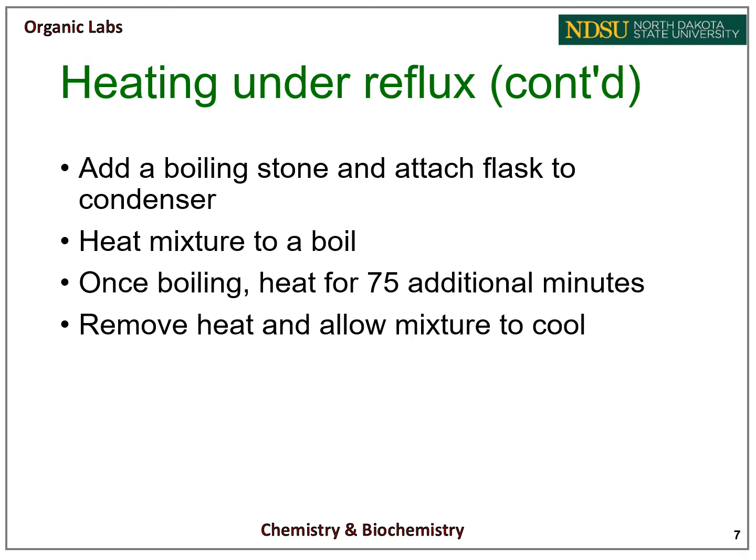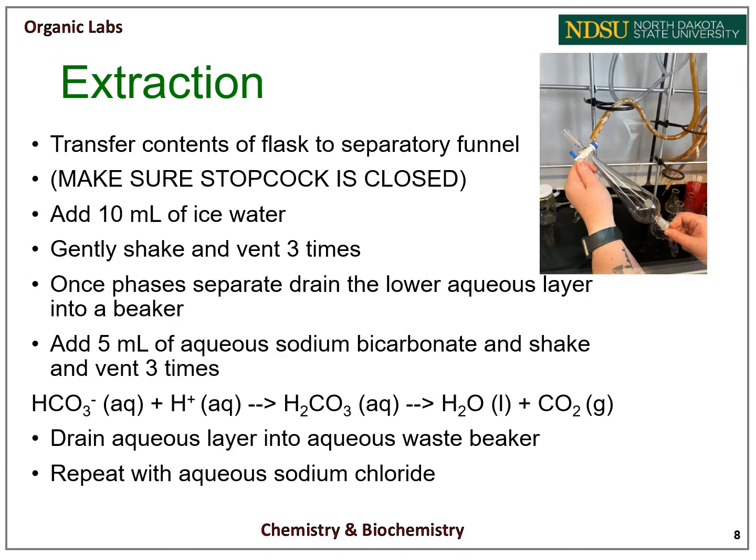After that, remove it from the heat and allow it to cool. Once your mixture has cooled, you are now able to perform a liquid-liquid extraction. You should be familiar with extractions from the caffeine lab. An extraction is when you're pulling out a desired species from one solvent to another, whereas washing is when you're removing impurities from a phase with your desired species. Today's case will be considered a wash.